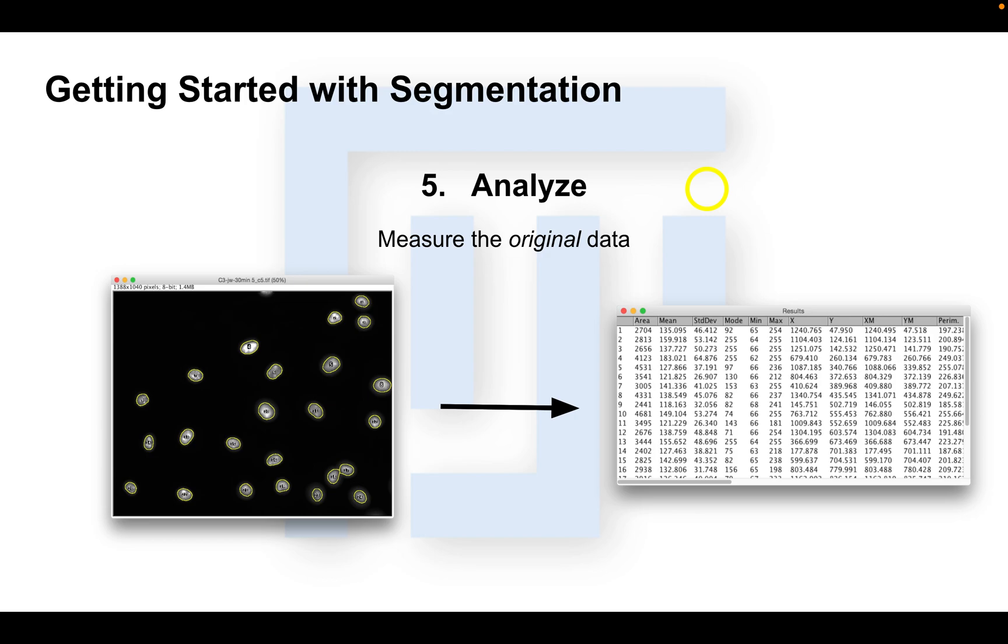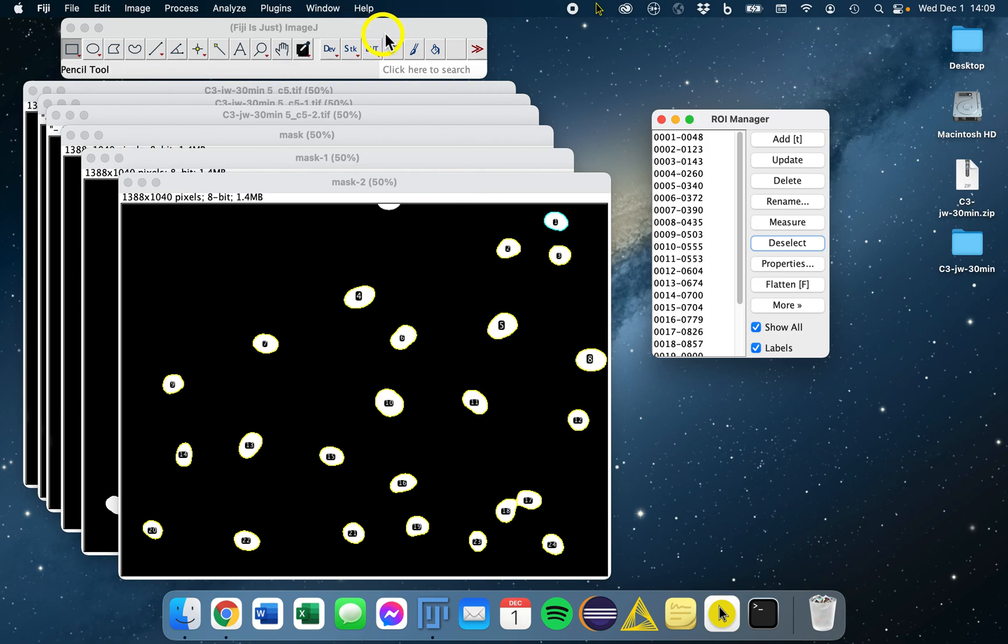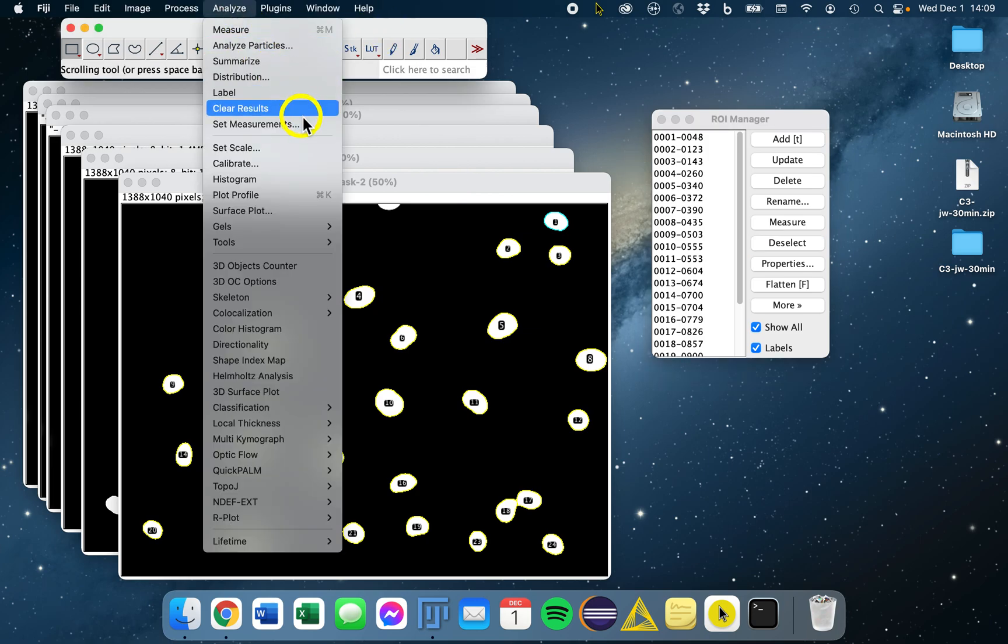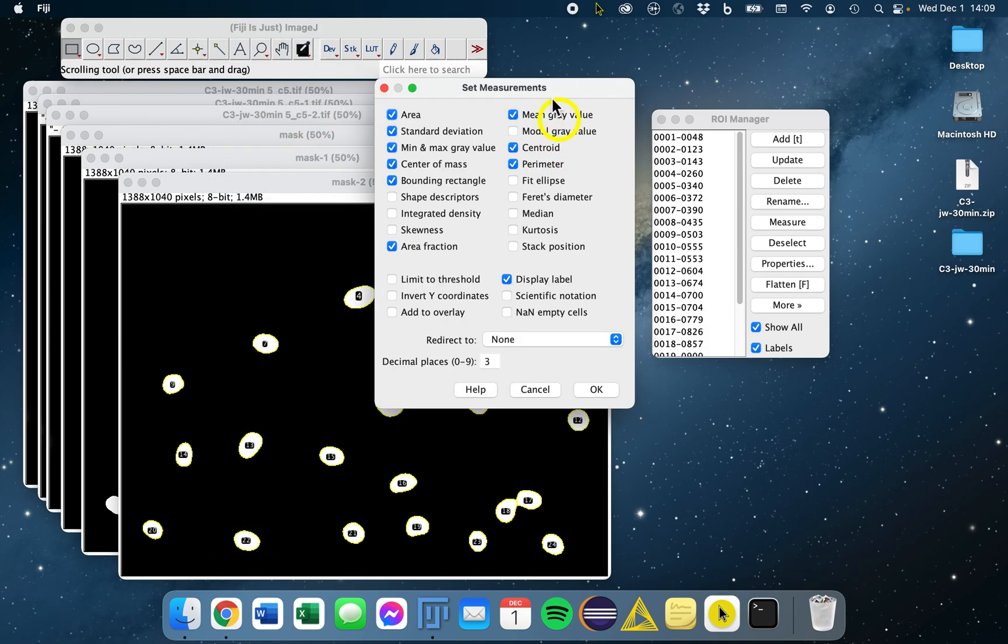So we can measure our objects now and analyze our data. There are a whole host of different measurements we can make. We go to Fiji, and you go to Analyze and Set Measurements, or just type Set Measurements in the search bar. You will see all the different measures that we can make and calculate from our ROIs.